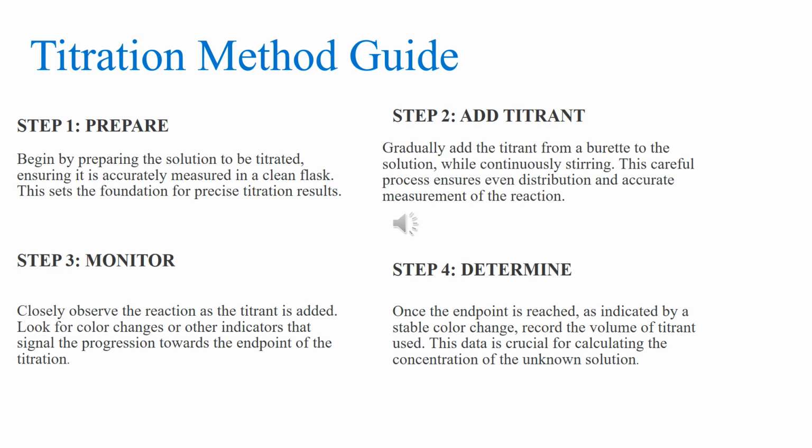The third one is monitor. Closely observe the reaction as the titrant is added. Look for the color change, because when the endpoint comes, it changes the color quickly. So the constant monitoring is very important.